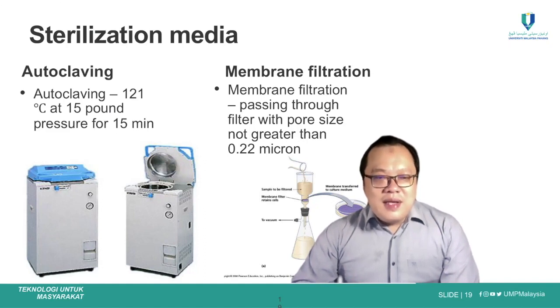Usually the media are sterilized by using autoclaving method or membrane filtration techniques.